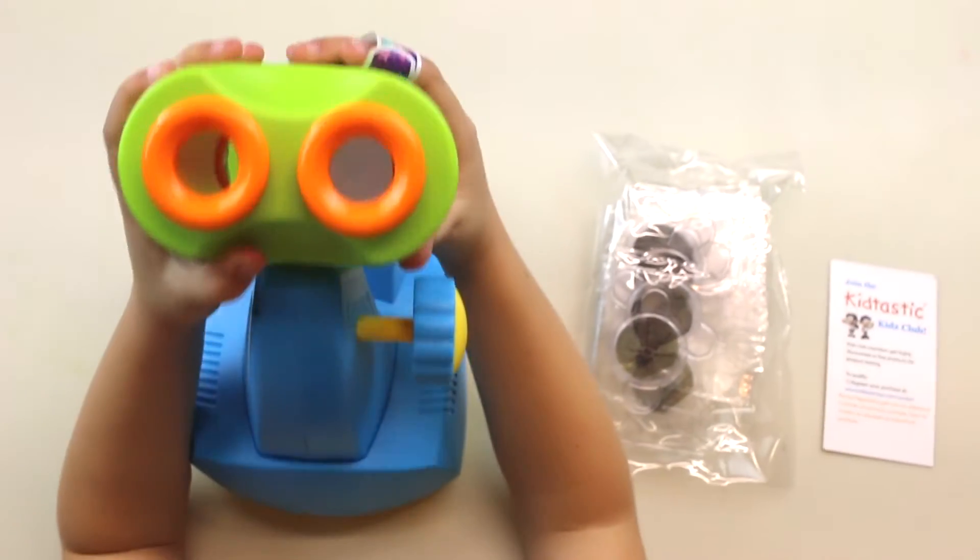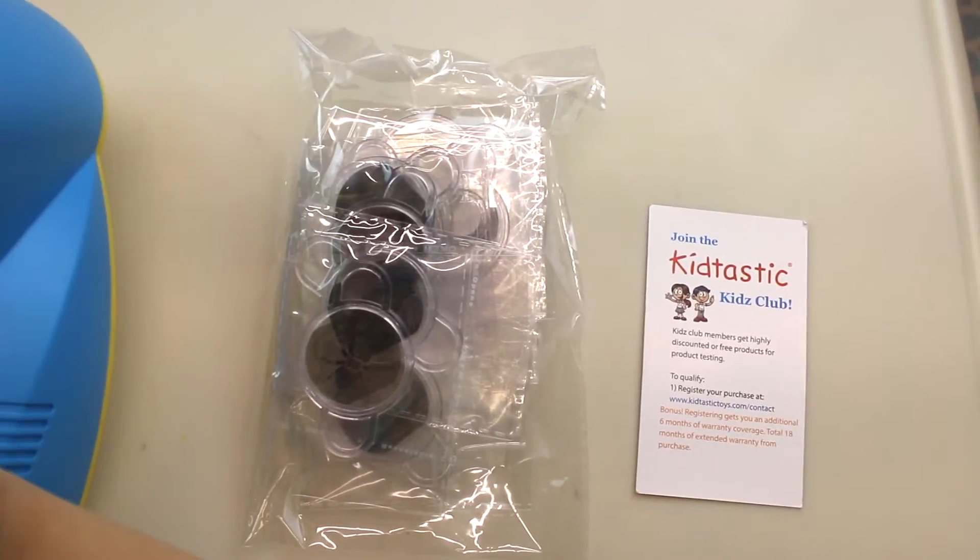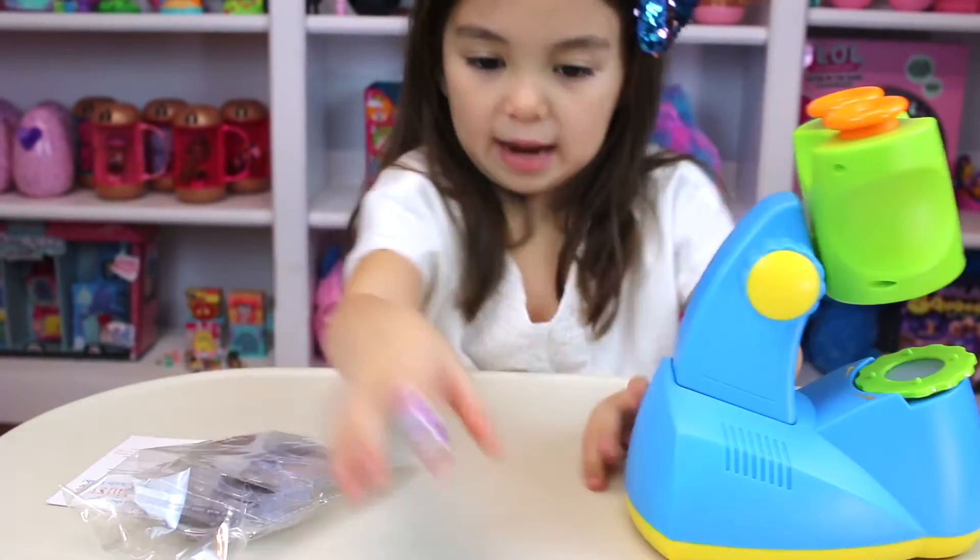We have the microscope, we have some specimens, and we have a little note from Kit-tastic. So let's open this specimen pack.